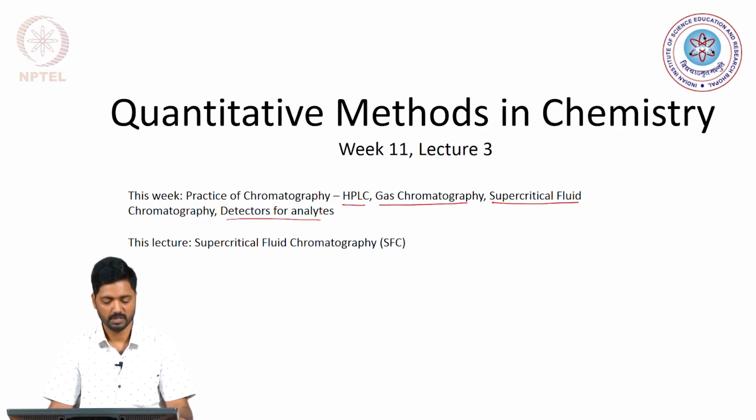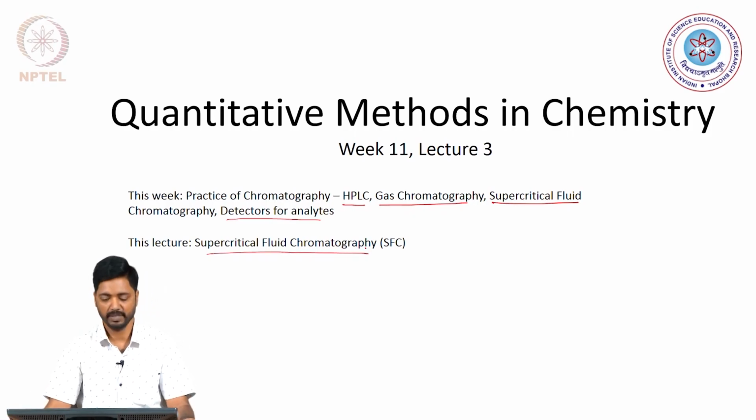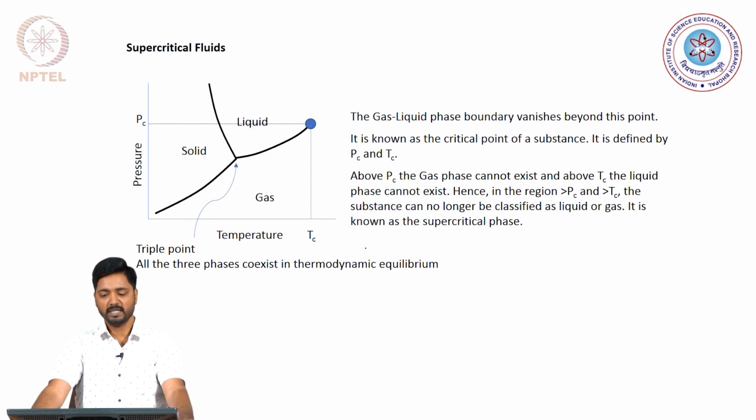that are commercially available. So, this lecture is specifically dedicated to the supercritical fluid chromatography, and let us try to understand what this concept is and what are its unique advantages and disadvantages vis-a-vis the traditional techniques such as high performance liquid chromatography and gas chromatography. So, let us first get ourselves introduced to what we mean by supercritical fluids.